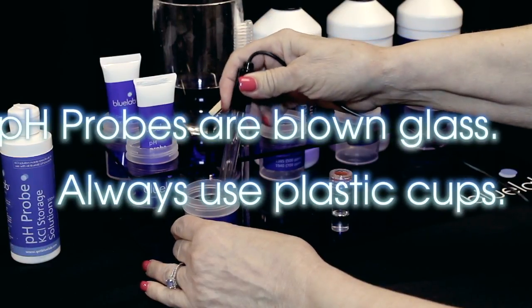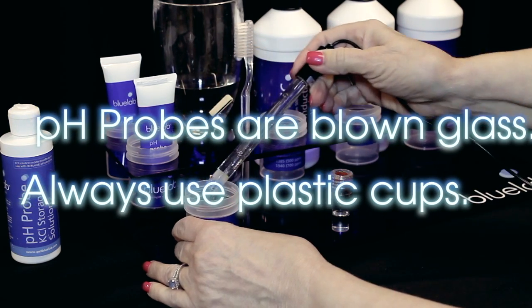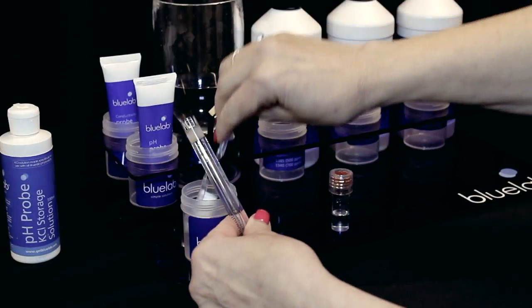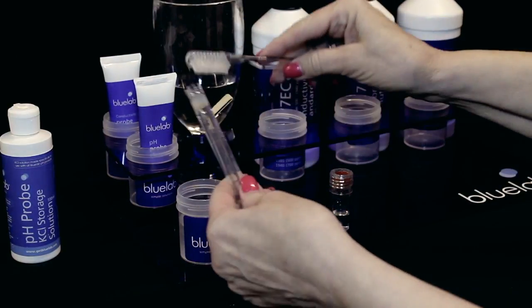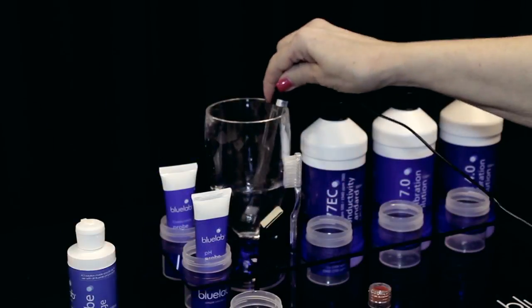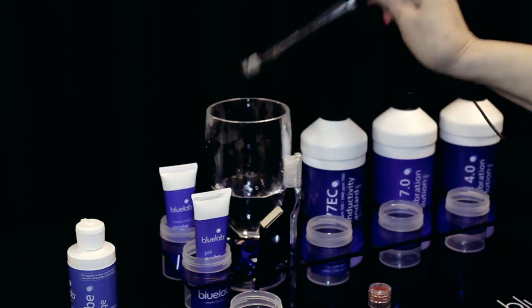pH probes are blown glass and are fragile. When cleaning and calibrating, always use plastic cups. If the pH probe is heavily contaminated, take a soft toothbrush and dip it in the cleaning mixture. Gently clean around the glassware. Immediately rinse the probe tip thoroughly in clean tap water to remove all traces of cleaning mixture.